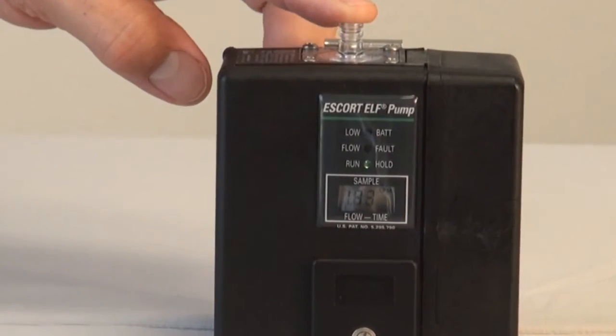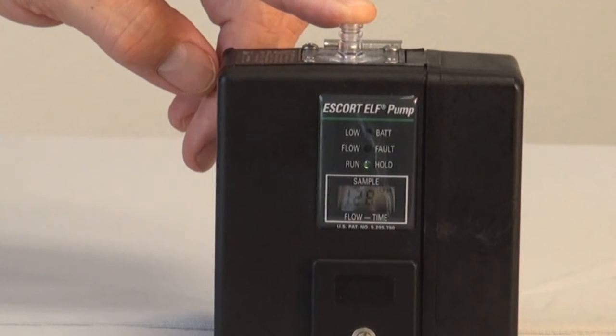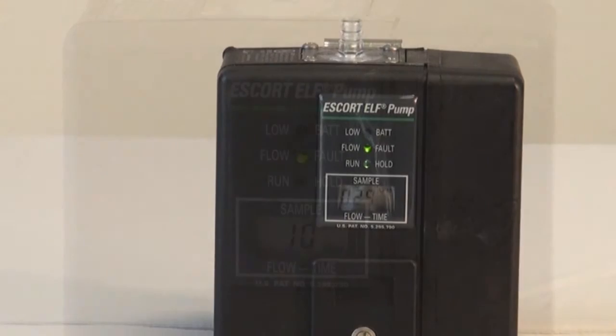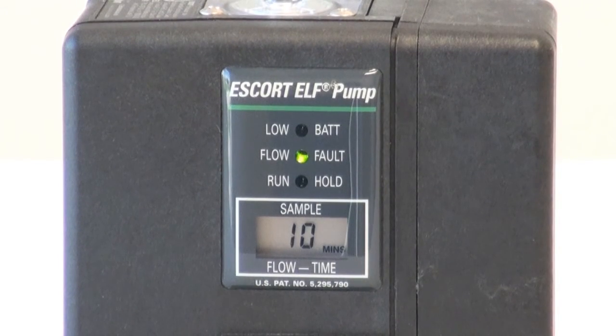If, for some circumstance, the flow is blocked or the pump cannot maintain the set flow rate, the pump will stop running. The LED flow fault light will come on and will remain on until the blockage is removed. If the blockage is not removed within one-and-a-half minutes, the run-hold light will turn off and the pump will shut down. The flow fault light will remain on and the elapsed sample time before shut-off will be displayed on the LCD screen.